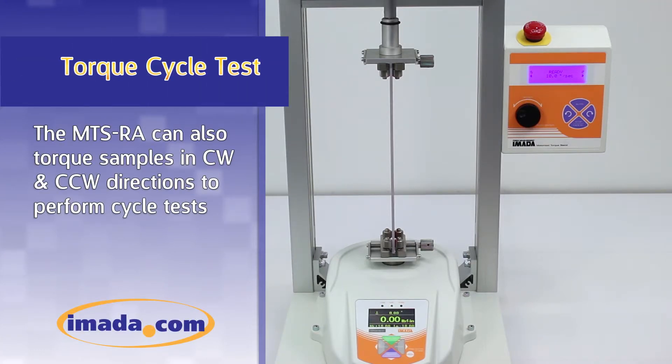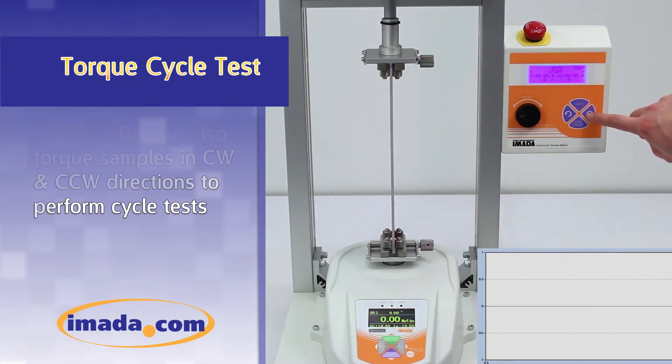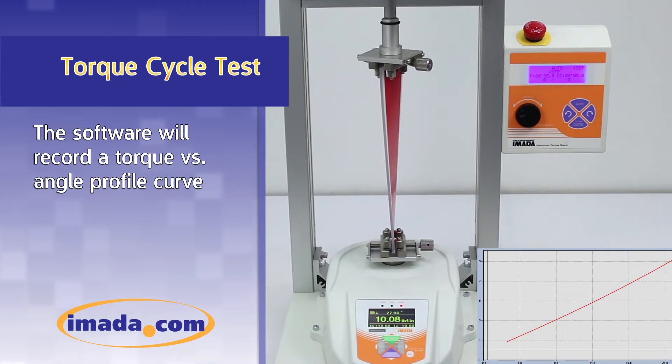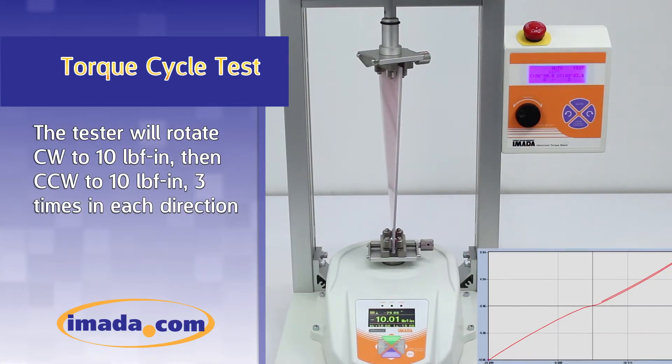The MTS-RA can also torque samples in the clockwise and counterclockwise directions to perform cycle tests. The software will record a torque versus angle profile curve. The tester will rotate clockwise to 10 inch-pounds, then counterclockwise to 10 inch-pounds, three times in each direction.